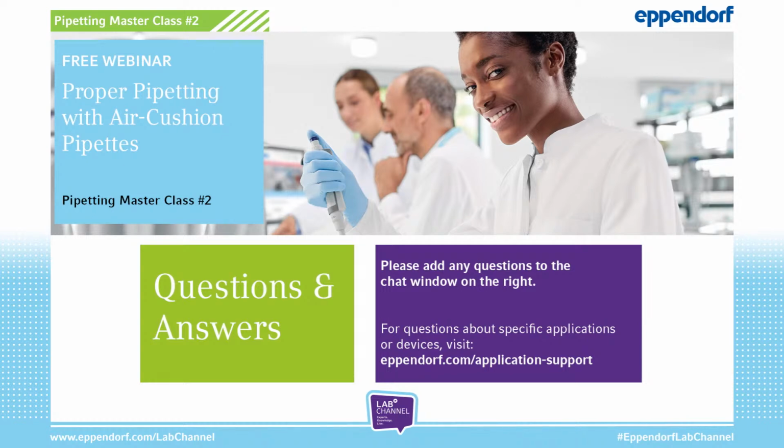Thereby you may aspirate the aerosols again before you switch to the second button and eject the tip. With a 1-button pipette, you aspirate and dispense the liquid and then eject the tip in the same downwards movement. So you do not aspirate the aerosols back into your pipette, leading probably to a lower risk of contamination.